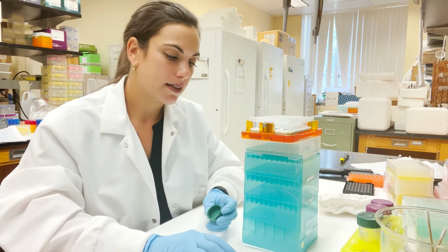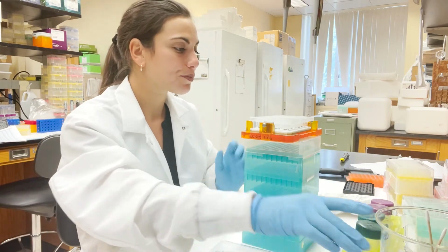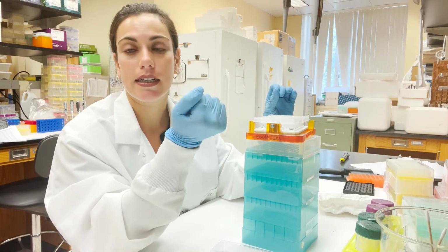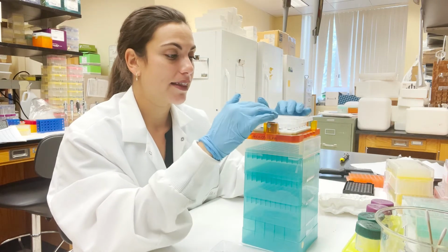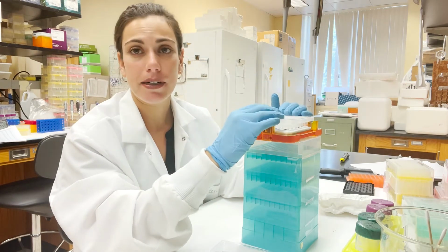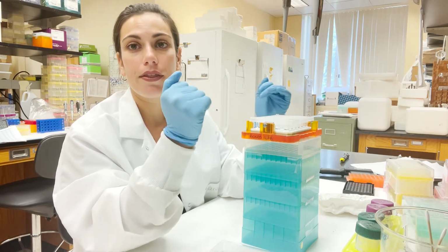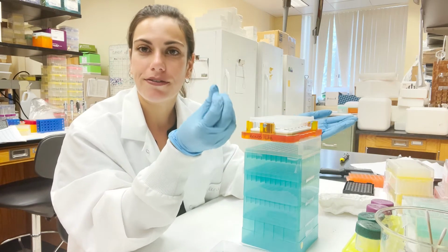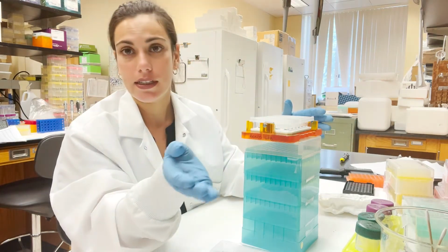We add 40 microliters. And this can be a little bit tough. Again, this is another part of the tedious process. But what we're looking to do is pipette 40 microliters of the EB buffer into each well very gently, and then get these beads back into solution. There's a couple different ways. The recommended way is to pipette the solution into every well and then remove from the stand and then dissolve them in solution. This can be a little challenging and can take a little bit of time. They'll often be flaky, but you want them to be really homogeneous in the solution. And I'll show you an example. Hopefully you can see it in the video.